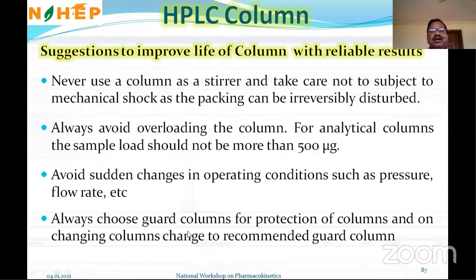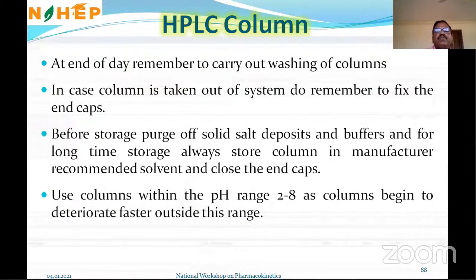And always choose guard columns for protection of the columns. On changing columns, change to the recommended guard column. This guard column will filter unused substances or any impurities that would block the actual column. At the end of the day, remember to carry out washing of the column. This is very important. One has to wash the column for at least 1 hour with HPLC water. In case the column is taken out of the system, do remember to fix the end caps. Both ends of the column should be closed if you remove it from the system.